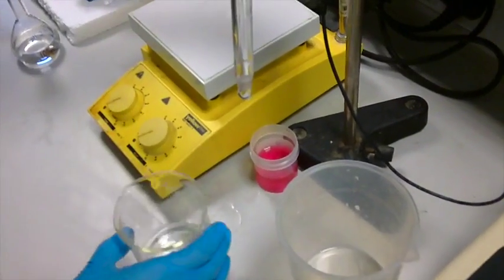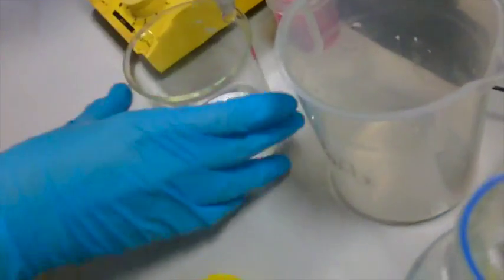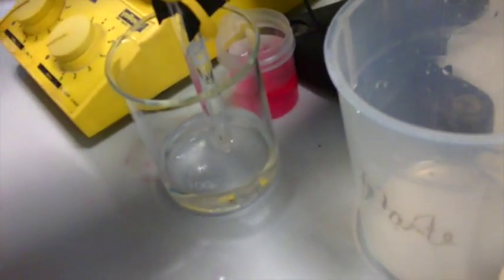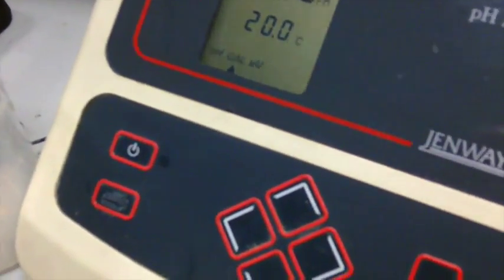Once you have the pH machine calibrated, you are now ready to measure the pH of your solution by slowly lowering the probe into your solution of named pH. The pH is then measured on the machine.